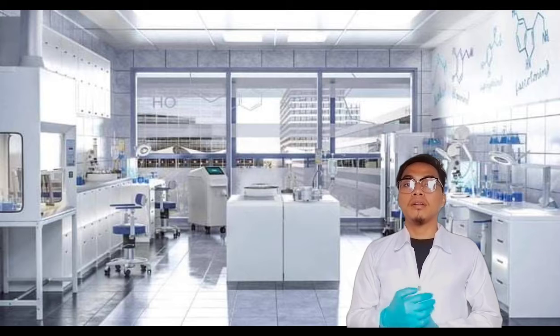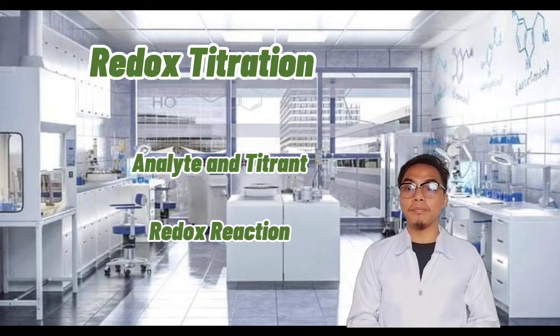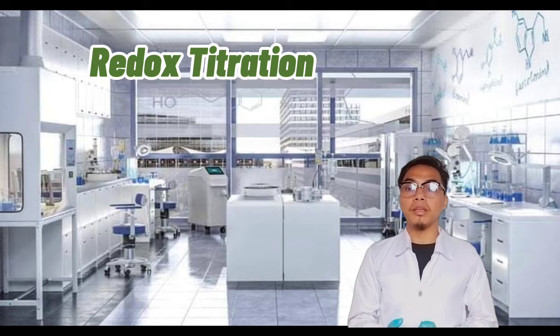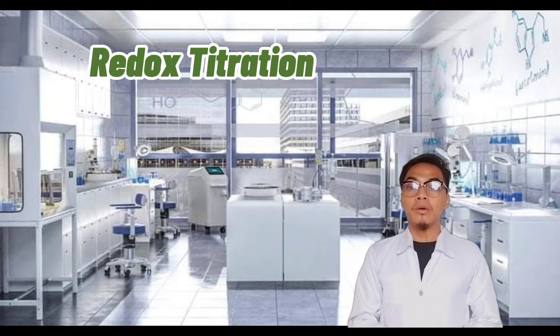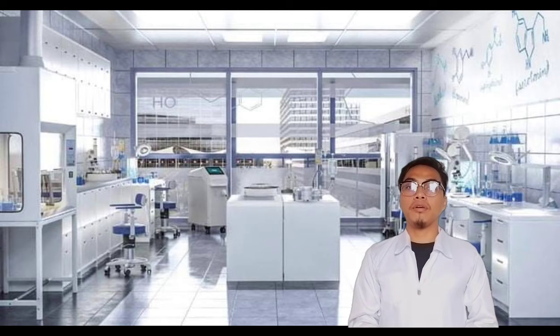Second, we have redox titration. This type of potentiometric titration involves an analyte and a titrant that undergo a redox reaction. An example of this type of titration would be the treatment of an iodine solution with a reducing agent, which produces iodide ion, and a starch indicator is used to get the endpoint.